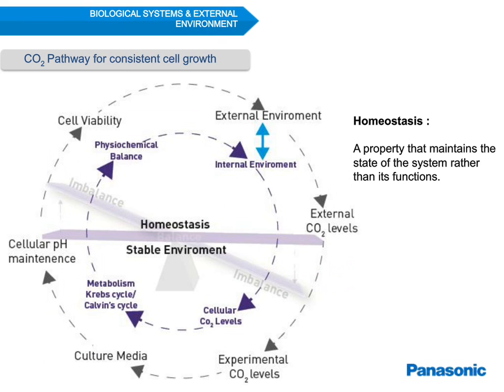On the other hand, the internal levels of CO2 need to be maintained in order to ensure a proper physiochemical balance through different cell cycles. If either the external or the internal levels mess up, the result may see drastic changes. The internal levels are maintained through media and sometimes the cells themselves. However, the external carbon dioxide levels are maintained through your incubator.